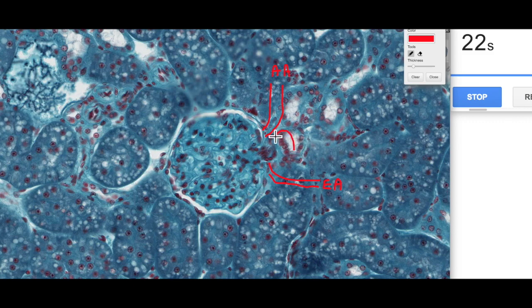This structure here, this dense region of nuclei, is known as the macula densa, and it's part of the juxtaglomerular apparatus, which we'll probably talk about in another video. Basically, these are osmoreceptors which are detecting sodium levels within the filtrate that's passing through this distal convoluted tubule.